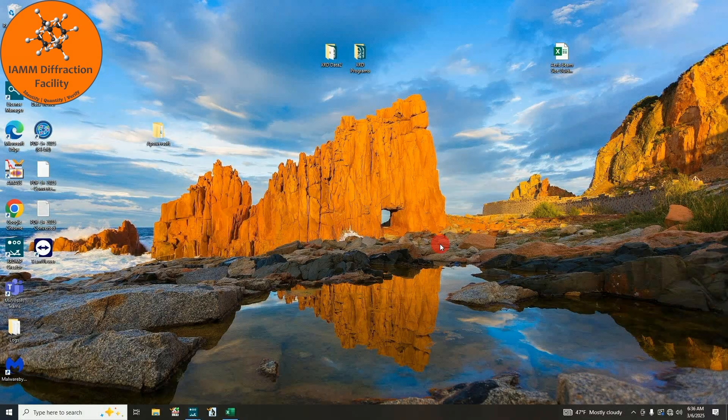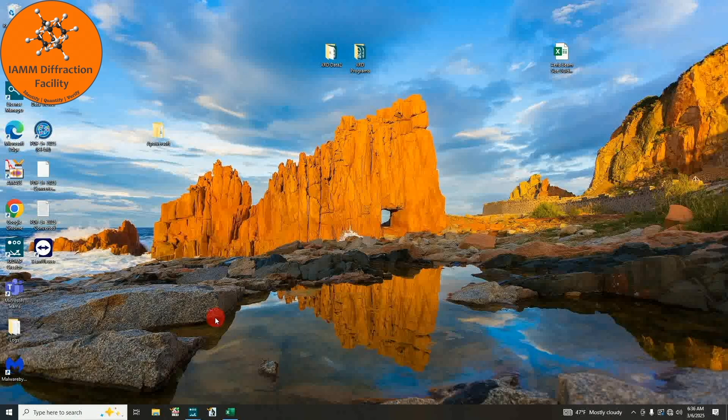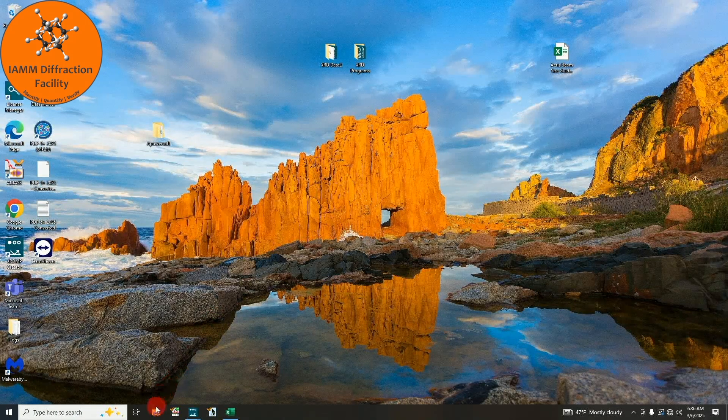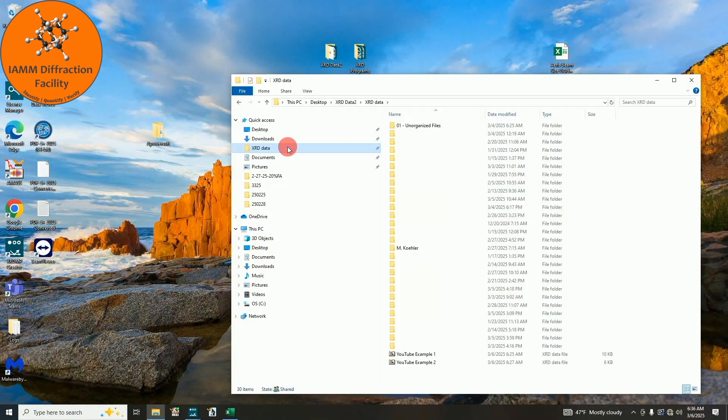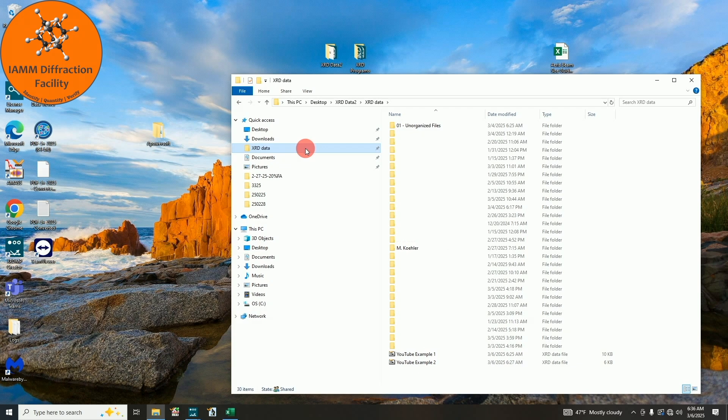After you've copied your data from the ARIS to the computer, you can come down here, click on the folder, and make sure you choose this XRD data folder. You should then see a list of names. For this video, I've hidden most of them except for two folders just to protect the names of our users.